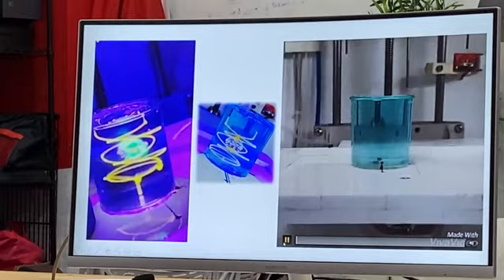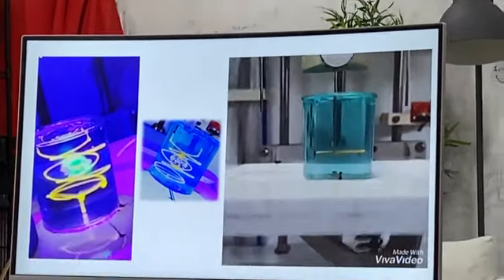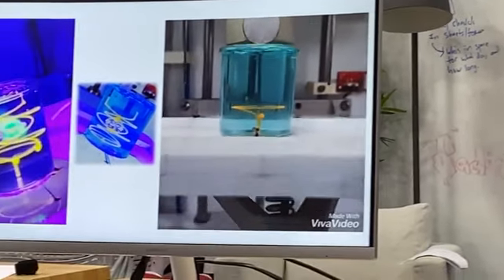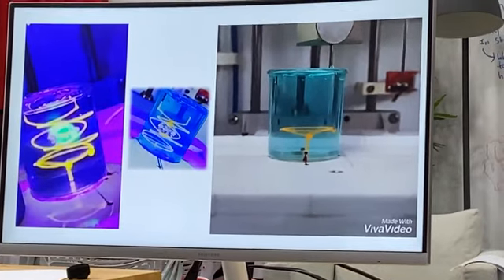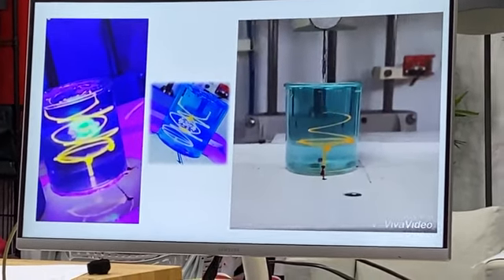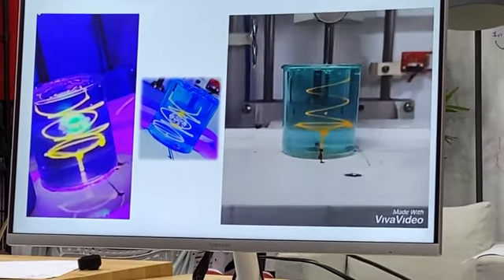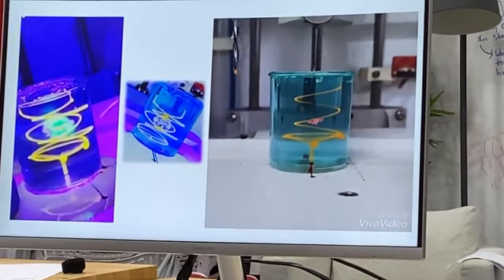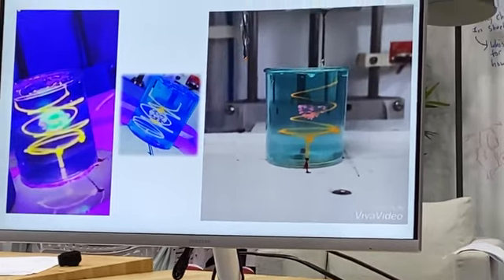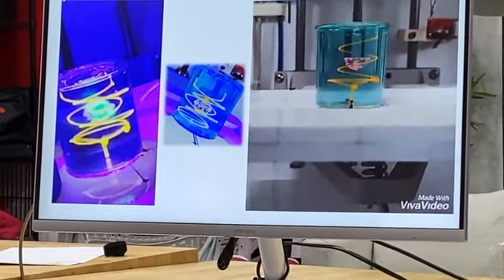So the gel matrix allows you to do that. Yeah, it serves like a support to support the biomaterial. Like liquid support. It looks like that liquid is not very viscous like water. Yeah, it's a kind of gel, but the rheology is different than the water, of course, just to keep the structure.